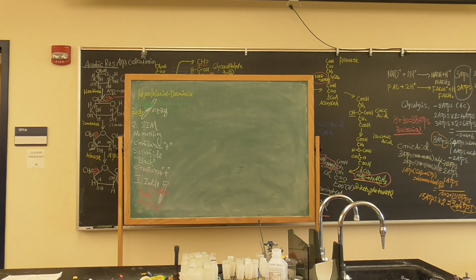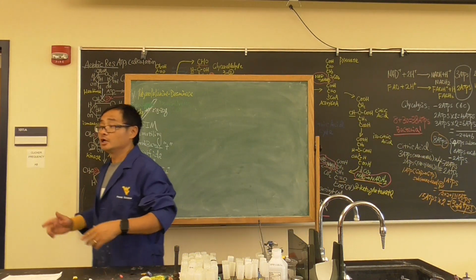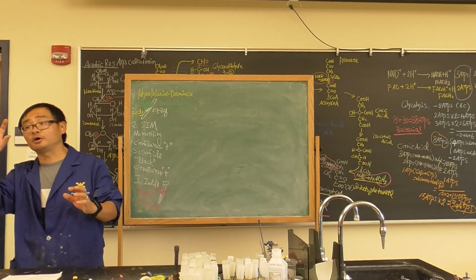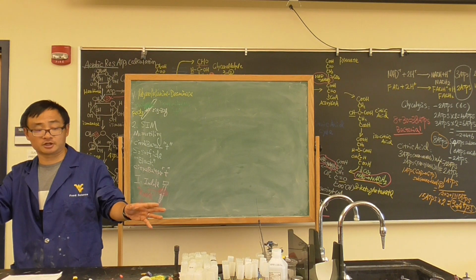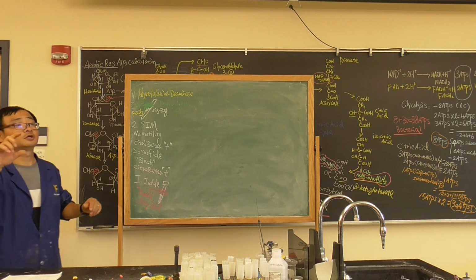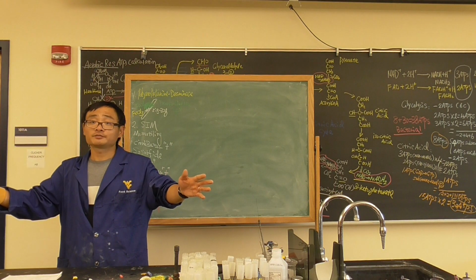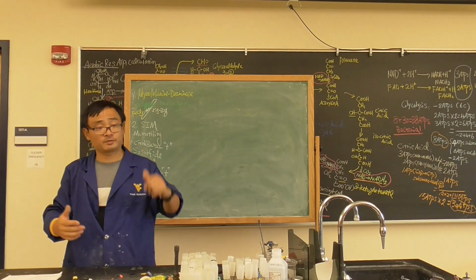I don't know about yours, and that's your bench partner's. Maybe you're still contaminated, so you shouldn't be verified. Okay, that's left for you. Very good, so that's how we did the test. You can go ahead and do it. The Kovac reagent is there. Make sure you read the label of the bottle. See, I just made a mistake. I trusted the outside of the bottle, I didn't look inside. But I know the results, so I saw it's not good, because that's methyl red. We'll talk about methyl red real quick.